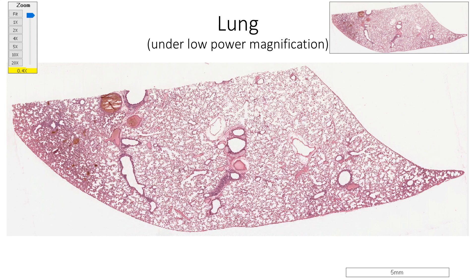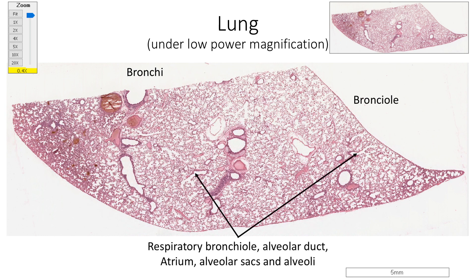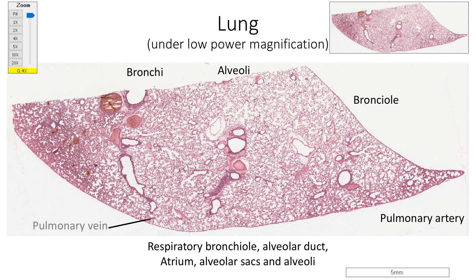A section of lung under low power magnification shows bronchi of various sizes, bronchioles, respiratory bronchioles, alveolar duct, atrium, alveolar sac, and numerous alveoli. We can also see sections of pulmonary arteries accompanying the bronchial tree, and pulmonary veins between the alveoli.